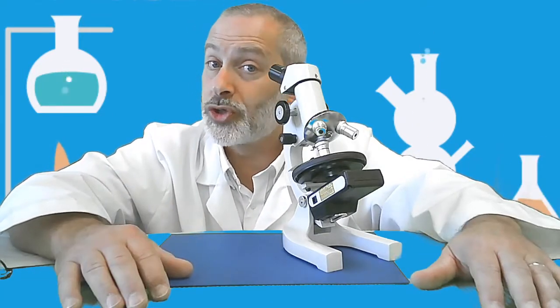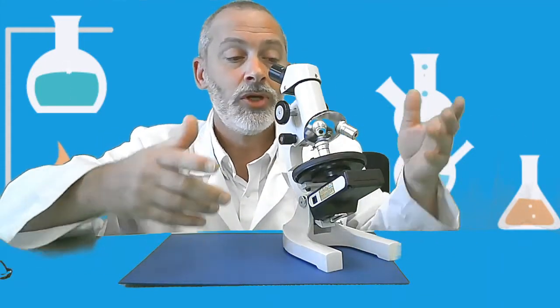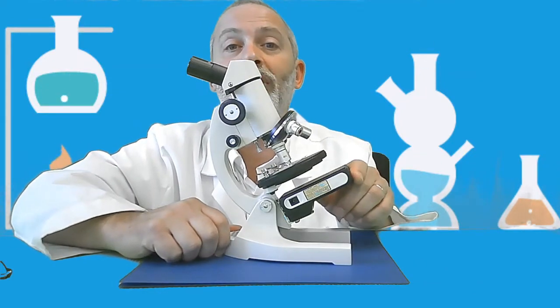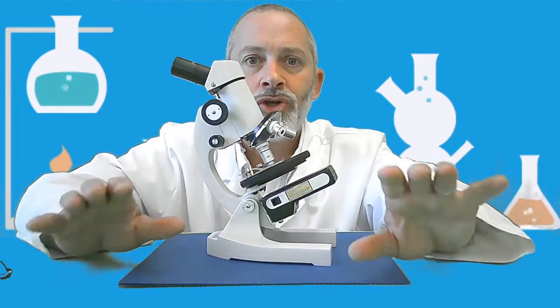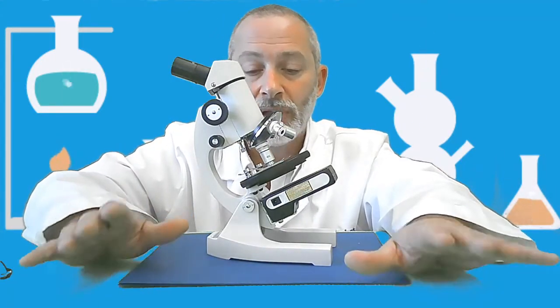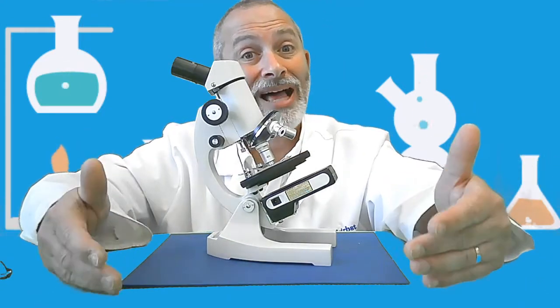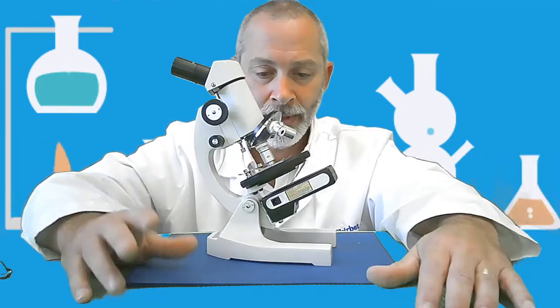Now, before we store these away, we want to do everything in reverse. So as we look at our microscope, we can actually crank down and turn off our light first. Turning the light off first will enable us not to cause a fire or allow the battery to run out or the bulb to run dead.